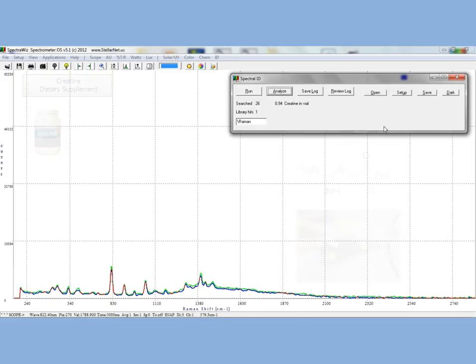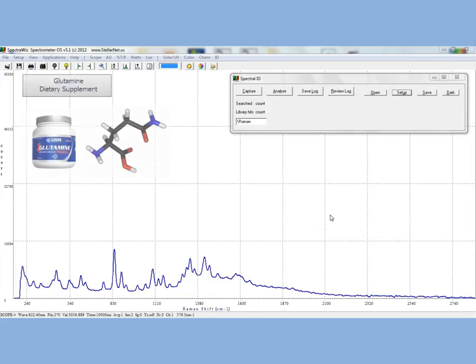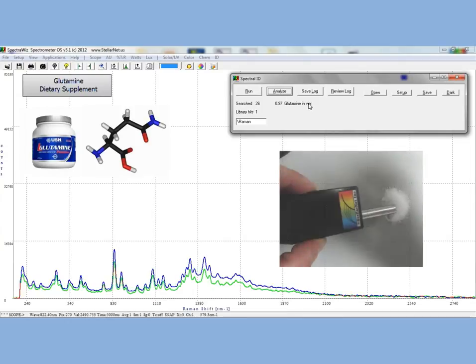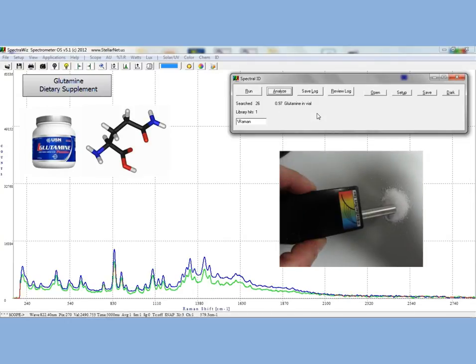In the next demonstration, we will be measuring glutamine, but instead of putting it in a vial, we will measure the sample directly with the probe. Glutamine is one of the 20 amino acids encoded by the standard genetic code. It is also marketed as a supplement and used for muscle growth.